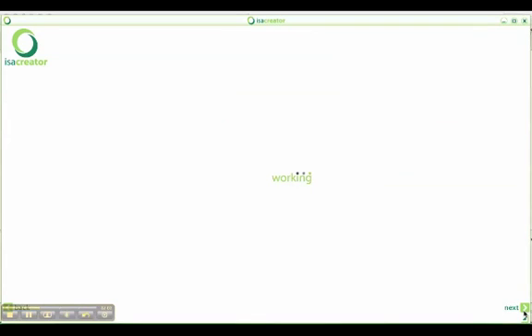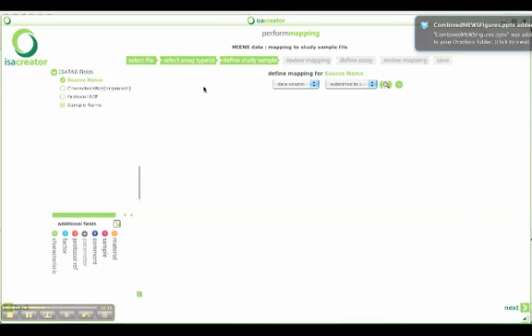So now the tool is parsing this Excel spreadsheet. This one is fairly large, and we have loaded the tool with the default configuration. So at the moment we only have these 4 fields. So quick overview of the layout of the tool. Here we've got the ISA field corresponding to the study sample table. They are listed here, 4 of them. Here we've got a number of components that we can add. Again, these are ISA syntactic elements, so we can add factors, protocol ref, parameter, comment, material.